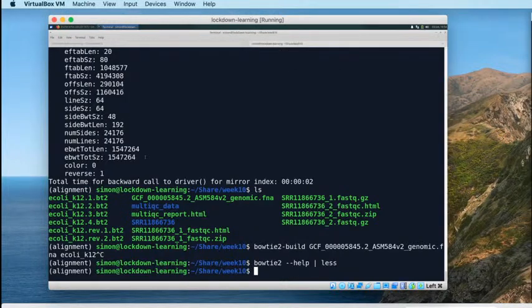Okay, but right now, what we're going to do is produce an alignment. To produce an alignment, we run Bowtie2 with our three blocks of arguments that we need to provide. Two of those are input. The first one is our reference genome, which we provide with the -x option. Our reference genome is what we created with Bowtie2 Build, and we gave it a name, and the name we gave it was E.